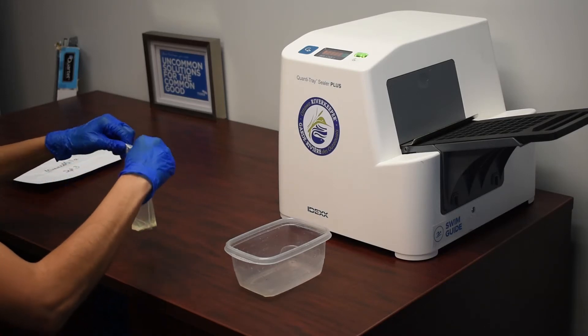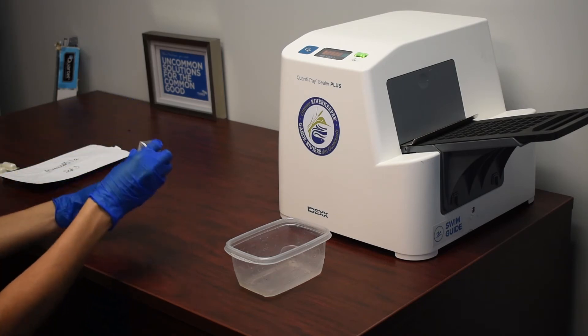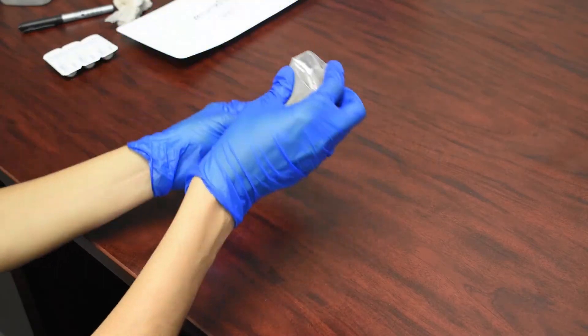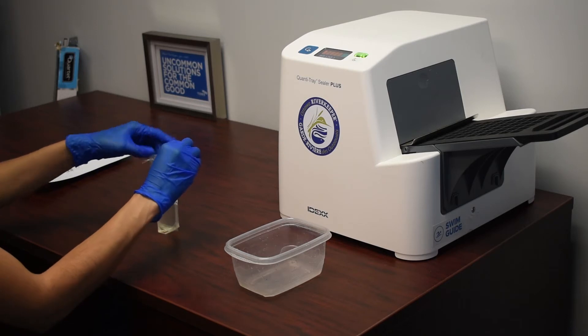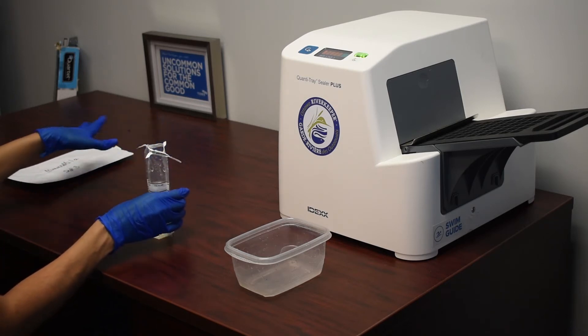We reseal the Whirlpack and allow the ColAlert solution to dissolve. Once the reagent has dissolved, we can then transfer the solution into one of our IDEXX trays.